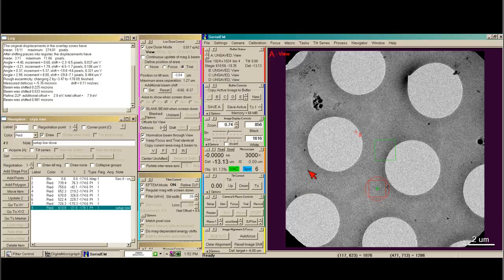So I'm going to go ahead and move to the bottom below my record area. And I just have to remember this for what I'm imaging because I don't want to focus or track on an area that I may want to image later. So I'm just going to turn this off, because sometimes stray mouse movements can accidentally move your trial area, and take a trial image.